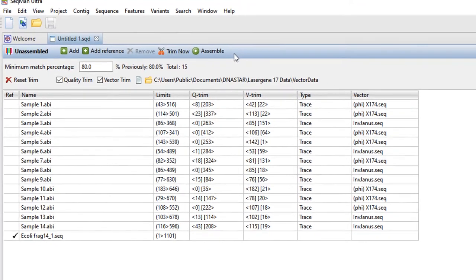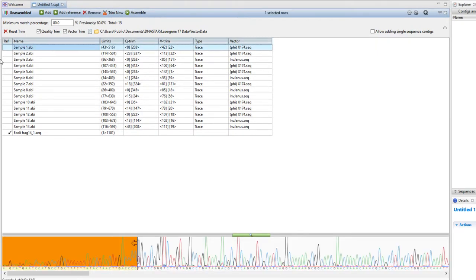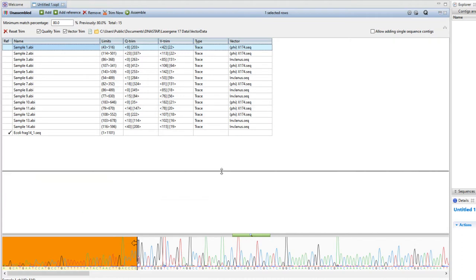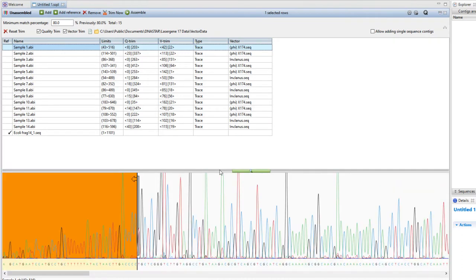To view trace data for a read, double click on its name. I'll make the Chromatogram preview area larger by sliding this bar upwards. The orange background on the left denotes sequence that was removed during the automatic trimming procedure.